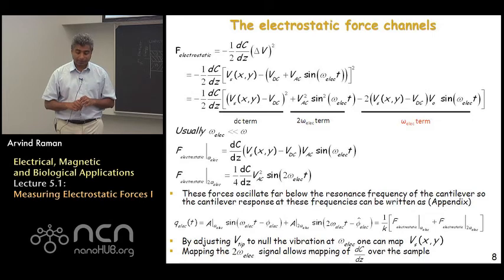sample, amongst other things. So the channels we fundamentally have in electrostatic force measurements is a channel at omega elec and a channel at 2 omega elec. We implement an electrical feedback on the omega elec channel to null the vibration at that frequency and thereby derive the contact potential difference at every point in the sample.